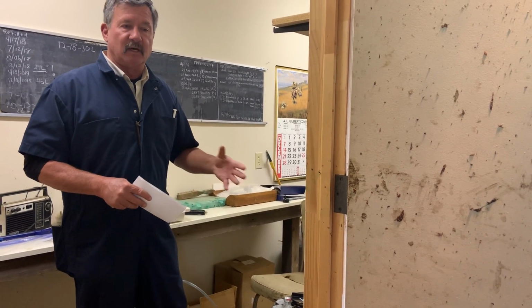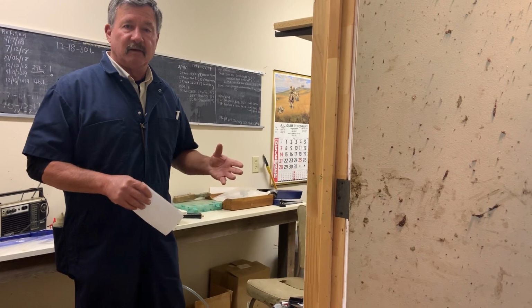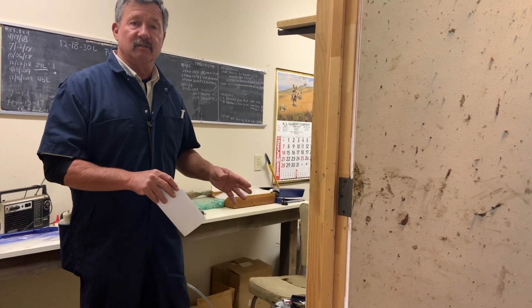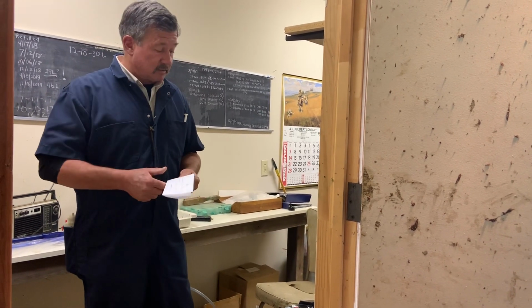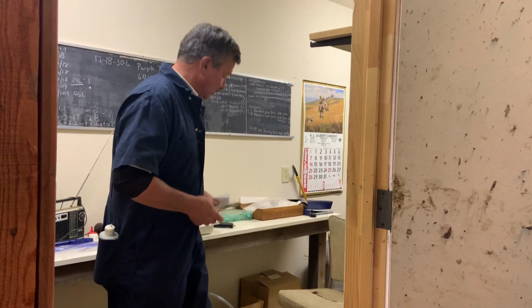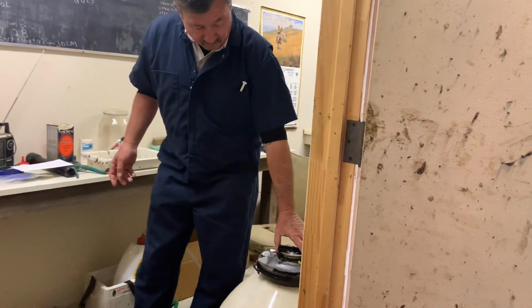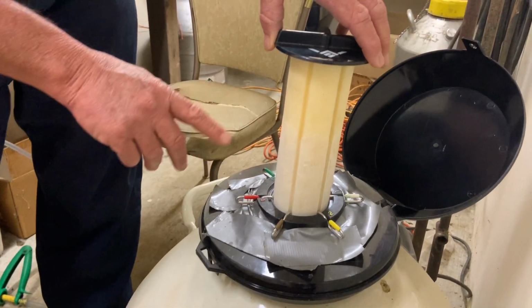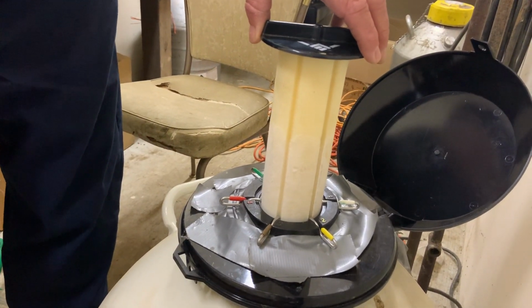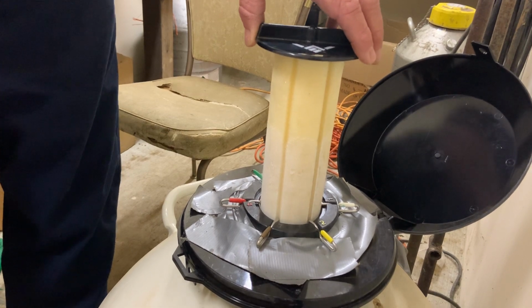We do that based on the longevity of the tank. Some of these tanks might be rated for 3 months or 4 months, and that is basically the rating of how long the nitrogen would stay in there undisturbed. So if you're going in and out of your tanks more often to pull out semen or embryos to place in cows, then you may need to recharge the nitrogen more frequently. So basically it's like a big thermos. They have a big stopper here, and you can see we have a white line, that's the frost line, so we know we've got plenty of nitrogen in there to keep everything cold.